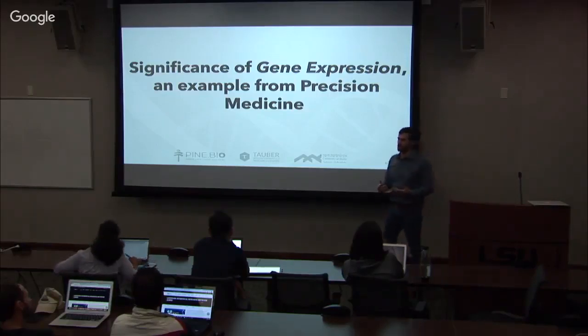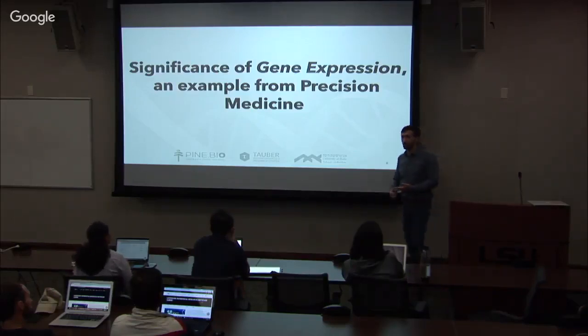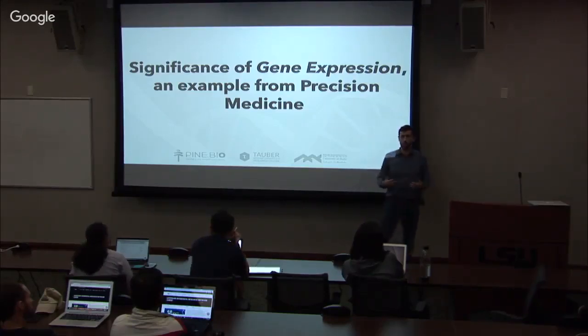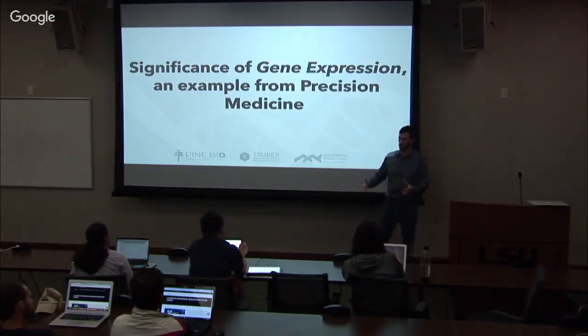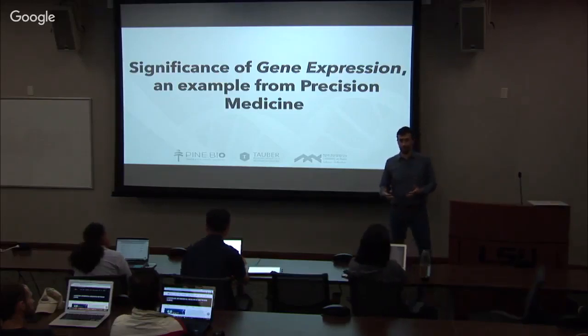And so the idea is that your selection of methods or strategies for analysis is going to be tightly linked with what data set you're using. And you'll see how selection of the reference genome, or even different mapping and analysis strategies, will change between different data sets. So as you go through these workshops in person or in these sessions, and when you do the online materials, you'll see a lot of similarity, but differences because of the data set.